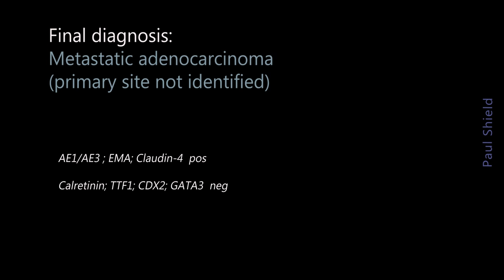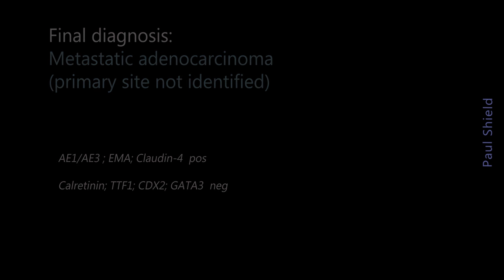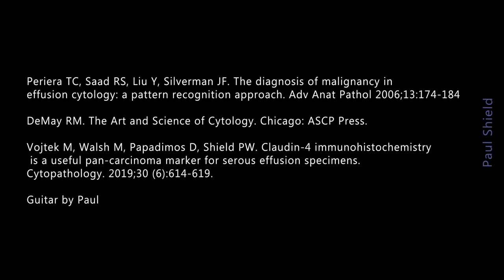We did a panel of stains looking for a possible indication of primary site. However, none of these were positive. So our final diagnosis was metastatic adenocarcinoma.